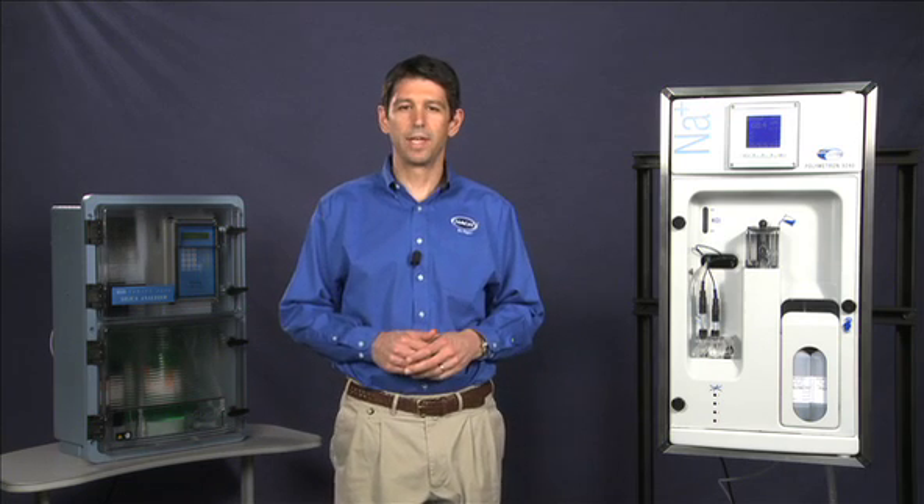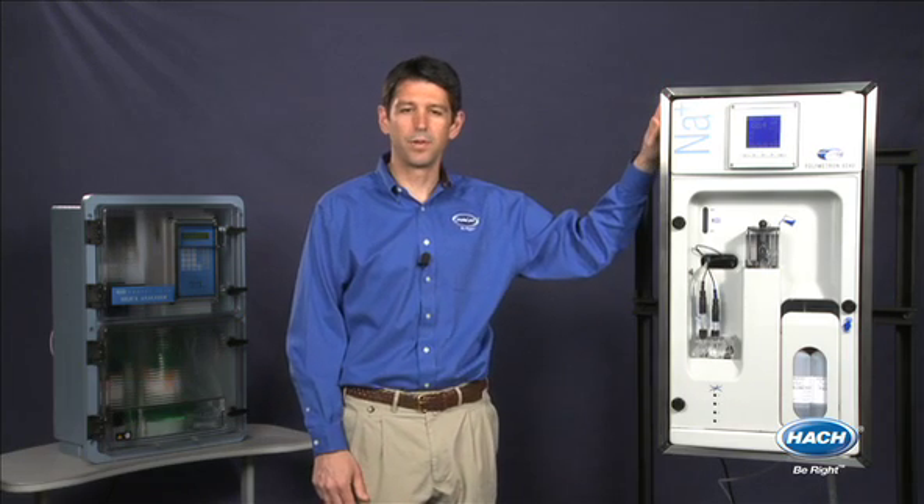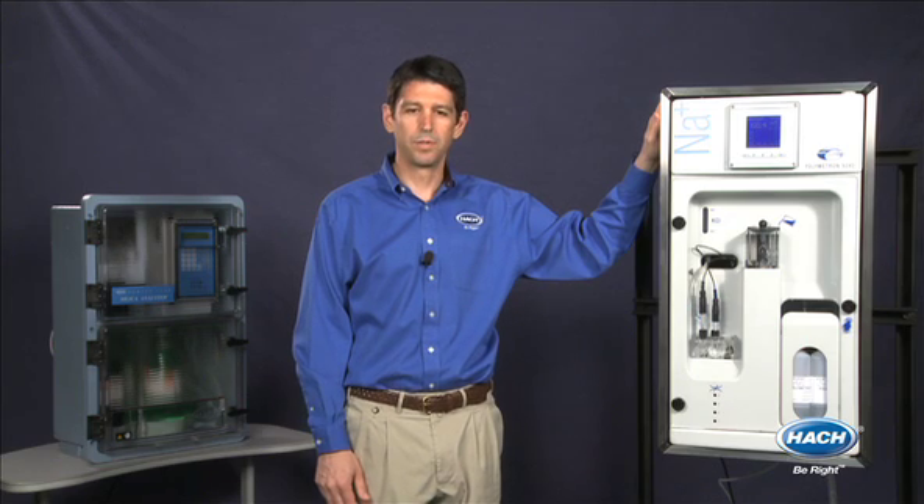Are you tired of etching electrodes and calibrating your current sodium analyzer every few days? Hi, I'm Eric Blaydorn, Technical Advisor for Hach Company. With Hach's innovative 9240 sodium analyzer, you can accurately monitor sodium in all power plant applications without ever having to etch your sodium electrodes again.